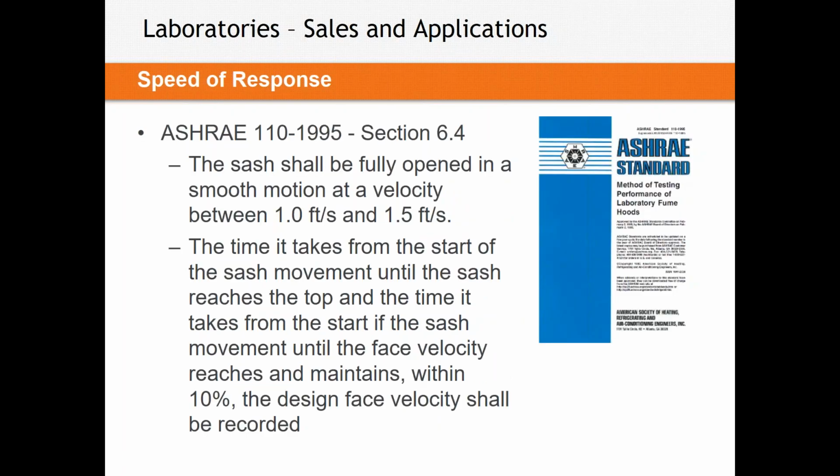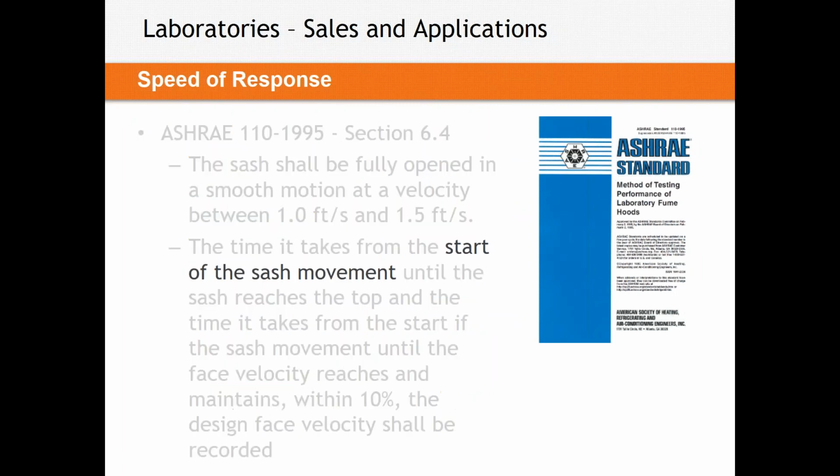Unfortunately, ASHRAE 110 in the United States has a similar definition, but they also have the opposite definition. Instead of saying the end of the sash movement is where we start the stopwatch, they started at the beginning of sash movement. So what this can do in the speed of response talk is fundamentally change the time we talk about for speed of response. And I'll show you what that looks like in a moment.